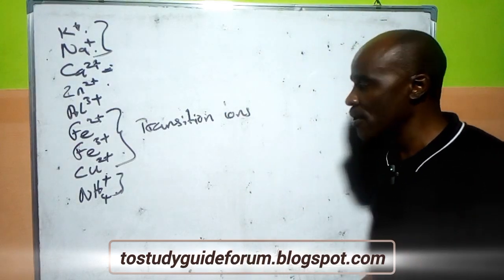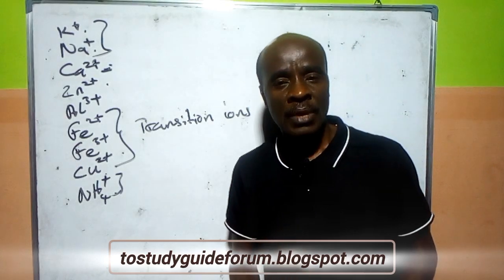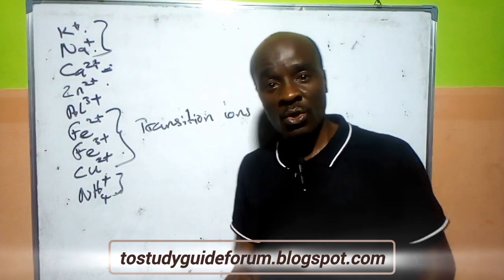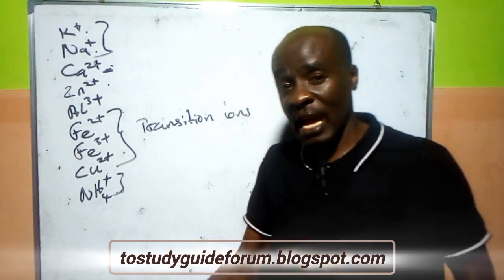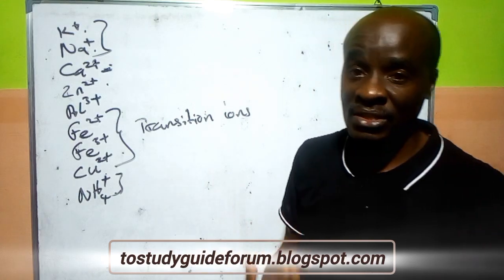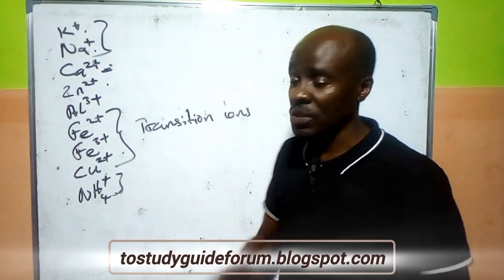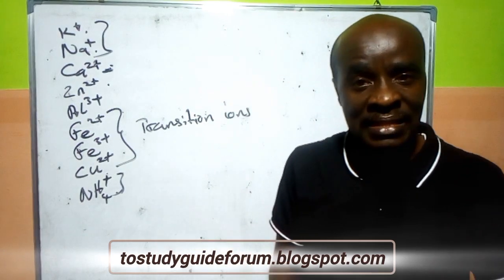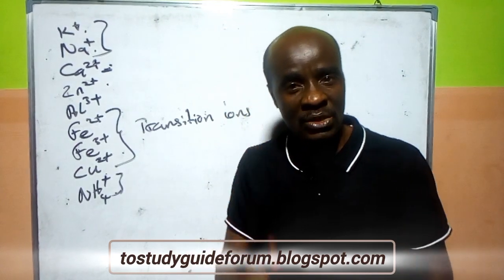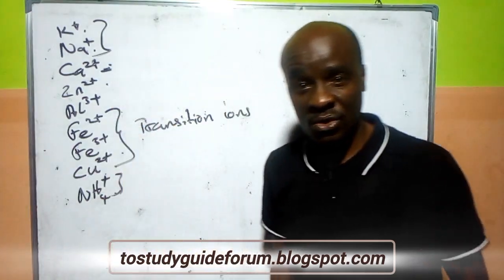So what it simply means is, if you add a salt into a solution and you have a color, as your observation you say colored solution. Because that thing has color, your inference should contain something like transition ions, because transition ions are known to have color. Each time any transition ion combines with the D block, when the D block electron is involved, they must also give you what? Color. But look at zinc. Zinc does not really give us a colored ion.